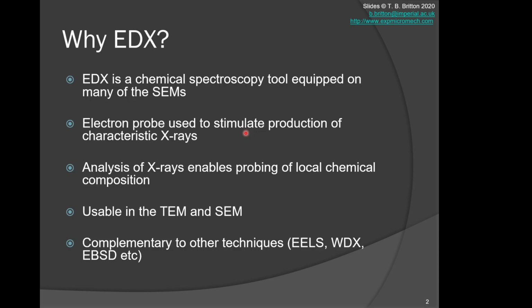The technique itself is complementary to a variety of other techniques, including electron energy loss spectroscopy, or EELS, wavelength dispersive X-ray spectroscopy, or WDX, and electron backscatter diffraction, EBSD. There's a range of others it's useful for as well, you can just imagine.